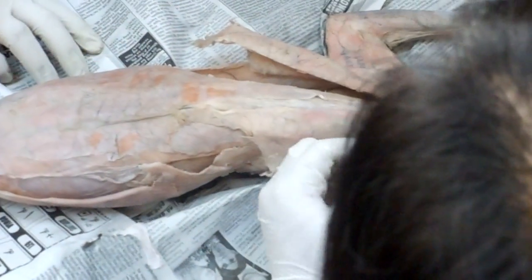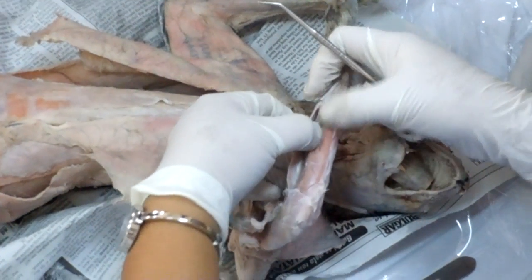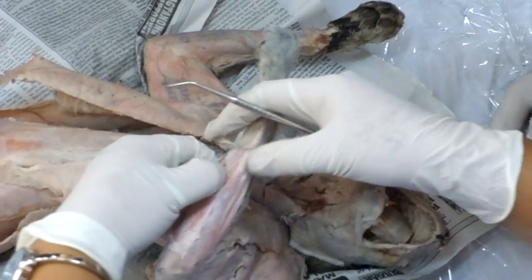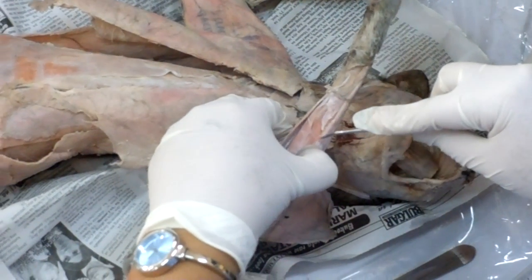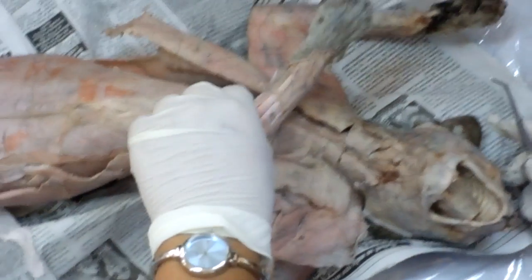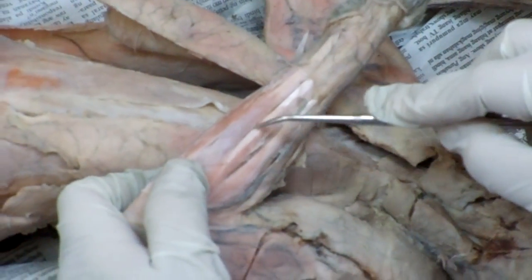Extensor carpi ulnaris. This is the first muscle next to the ulna. Origin: lateral epicondyle of the humerus and semilunar notch of the ulna. Insertion: proximal end of the fifth metacarpal. Okay, so ito siya. Extensor carpi ulnaris.